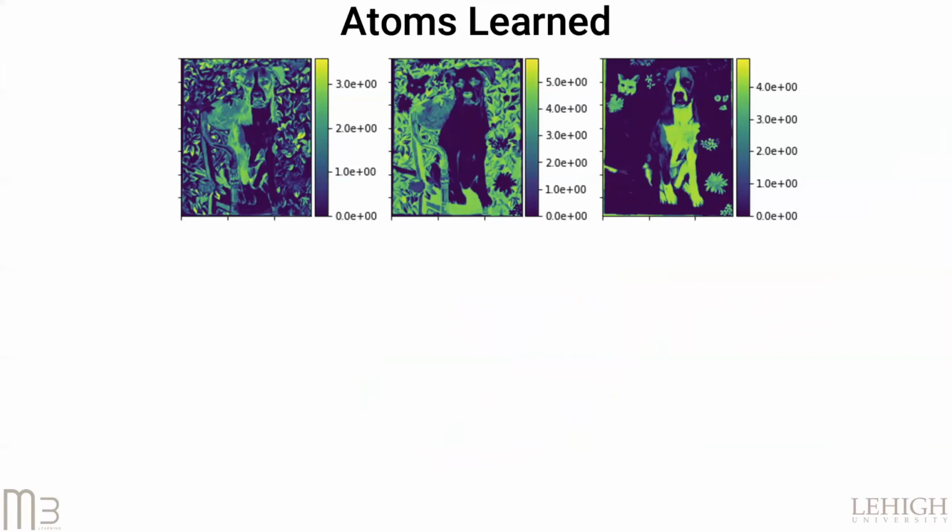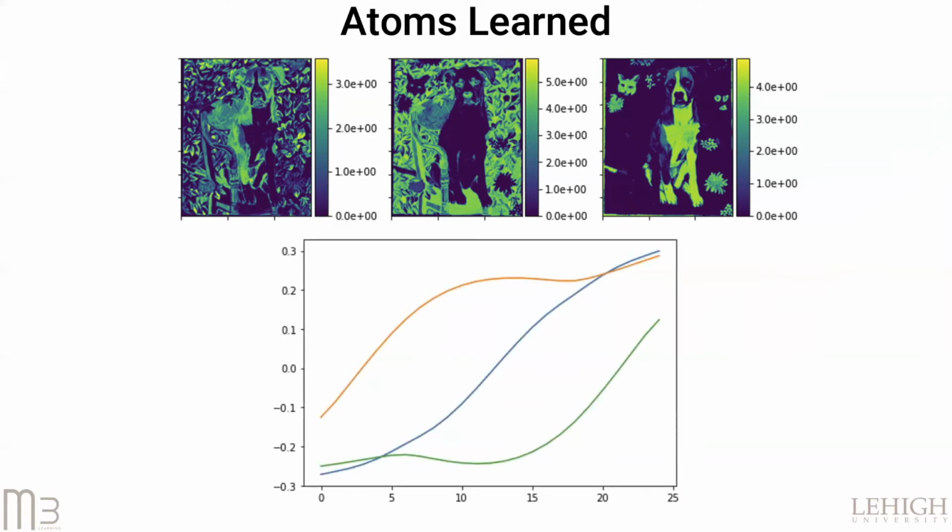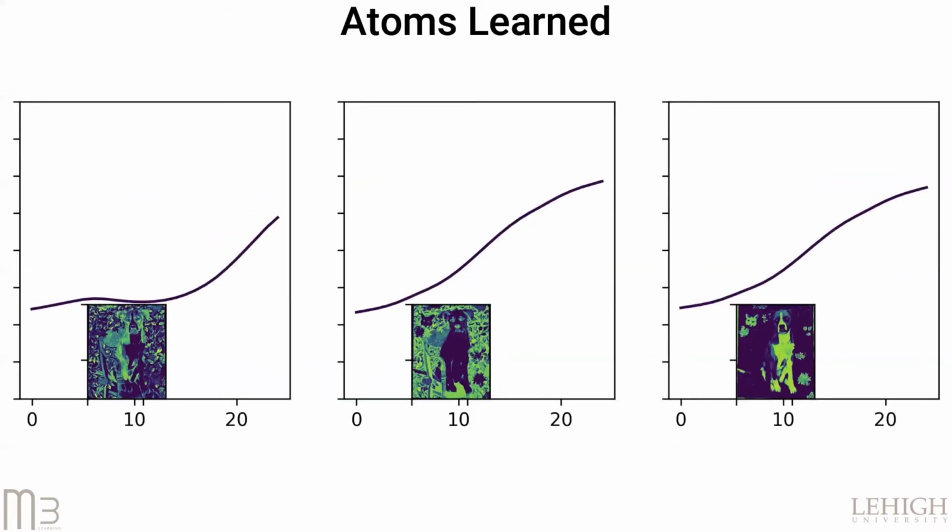We compute the dictionary learning on 3 components. Again, we can see that Nala's features are clearly detected. But if we look at what the atoms or the endmembers of the spectra look like, they just look like smoothed out or averaged out versions of the original spectra. We can look at this a step further.